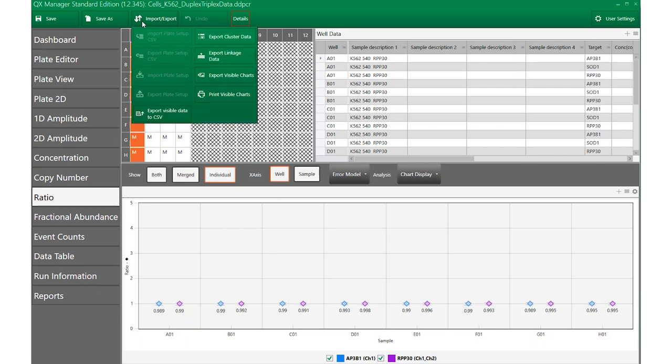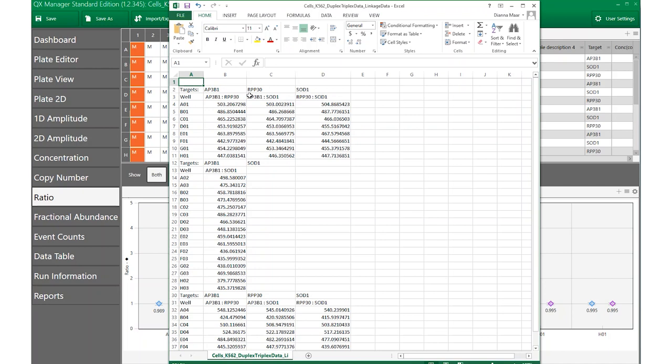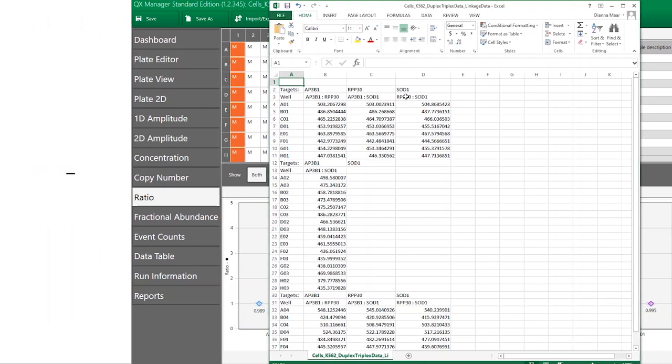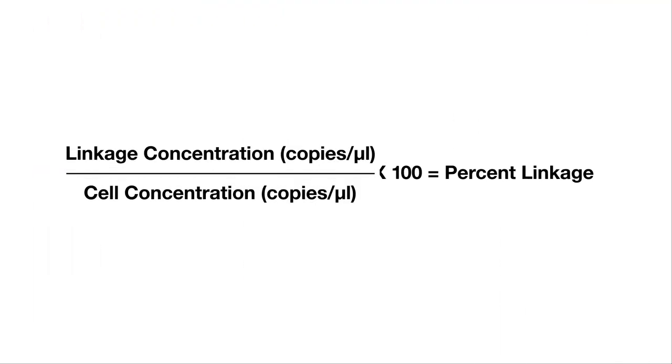These data can be found by clicking on the Import-Export button and then clicking on Export Linkage Data. The concentration number reported for each pairwise comparison is the number of cells per microliter that are positive for both reference assays. Always calculate the percent linkage of your control reactions, RPP30 and SOD1. This is an important control to ensure that the protocol was well executed. To calculate percent linkage, divide the linkage concentration in copies per microliter by the concentration also in copies per microliter and then multiply by 100.